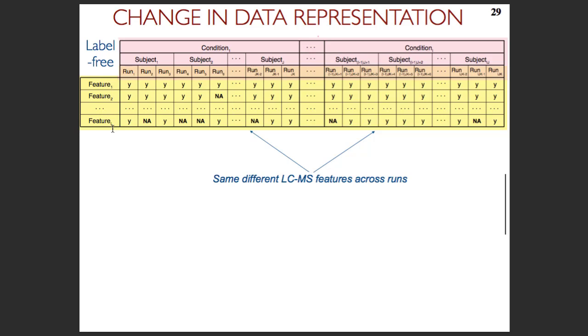So there are several important things, right? We have the same feature across all runs because in, for example, SRM experiments, we can target exactly the same ion in all the runs. In DIA, we can extract the fragments across runs for the same m/z. And in LC-MS, we can identify MS1 peaks in some runs, and we can propagate the intensities by matching mass over charge and retention times. So usually, in chromatography-based quantification, we can ensure, with some more or less missing values and so on, that we have the same features between the runs.